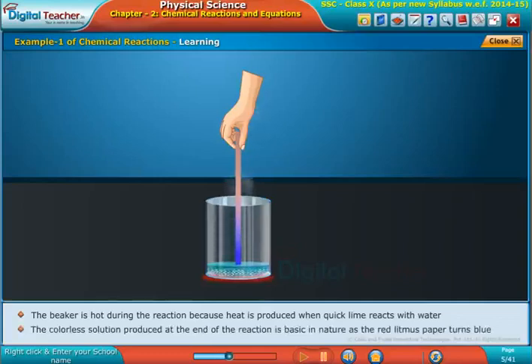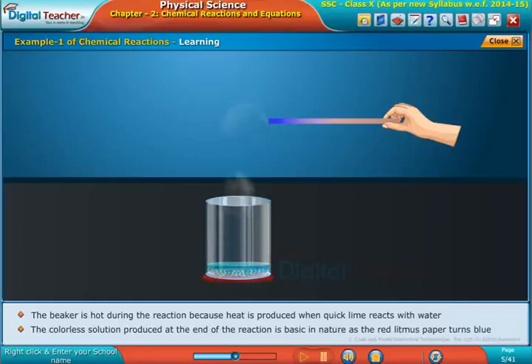The colorless solution produced at the end of the reaction is basic in nature, as the red litmus paper turns blue. Now let us do another activity to learn about chemical reactions.